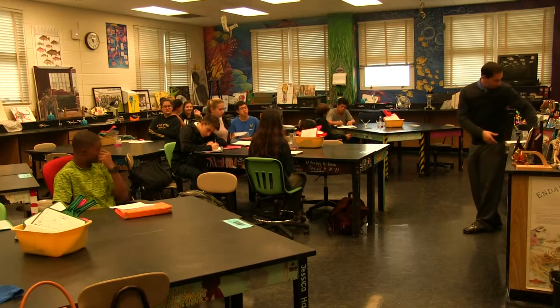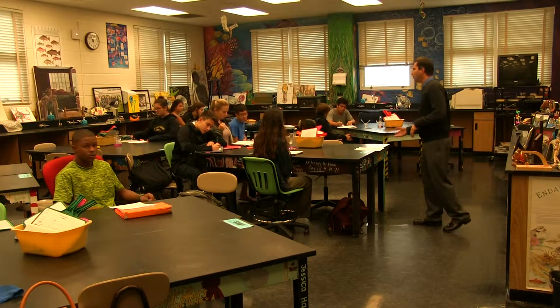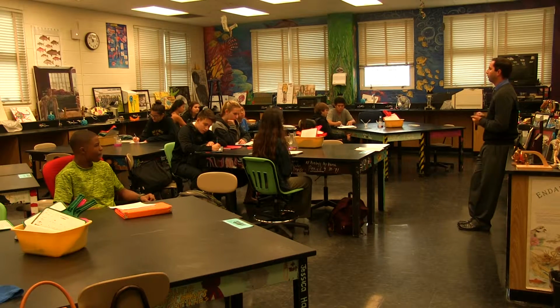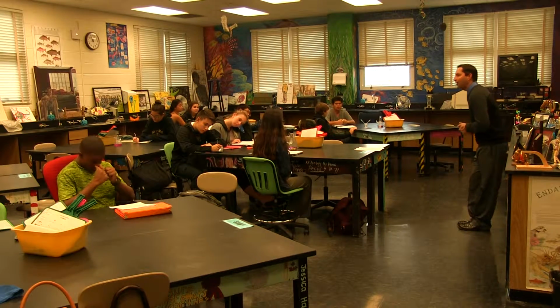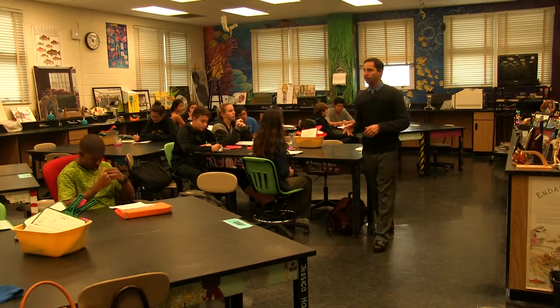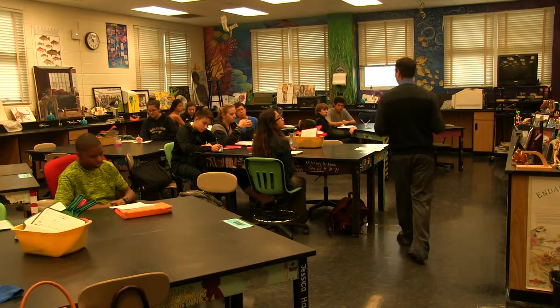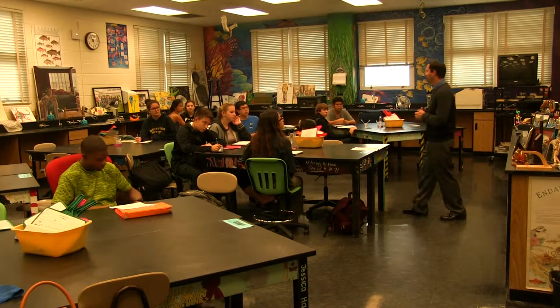The second one here says, how is a control beaker serving as a standard? So how do we really compare your experimental against them? I'll give you a hint. It's real simple. You use your eyes and you do what? Color. Now, you guys might not think it is a super good way of comparing these things, but we do this in industry. Can you guys think of any tests that might change color and tell us something that might be available commercially?